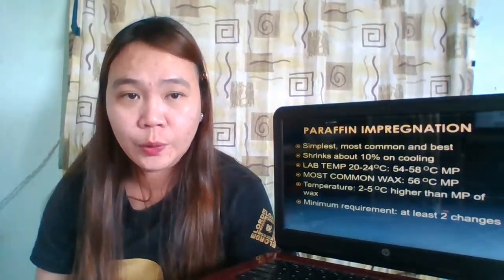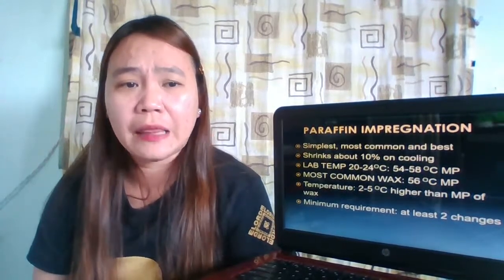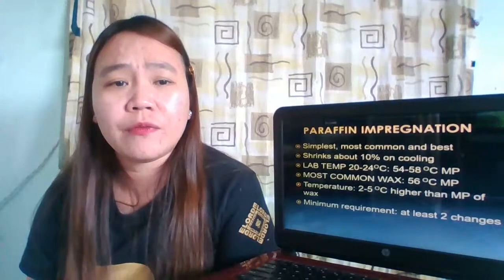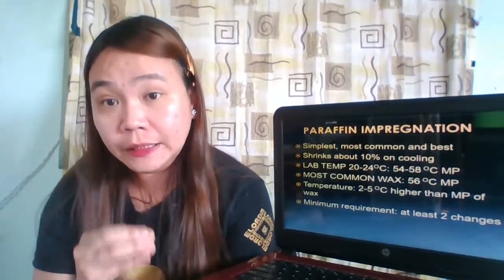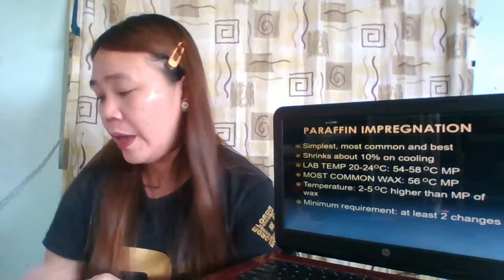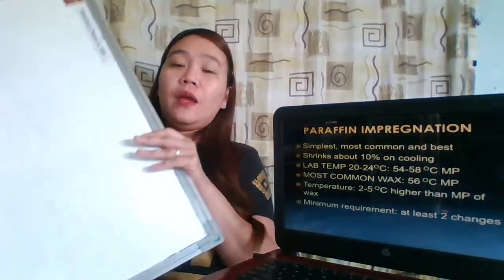So, in the case of paraffin, common waxes which are available for use in the laboratory would have the following melting points.